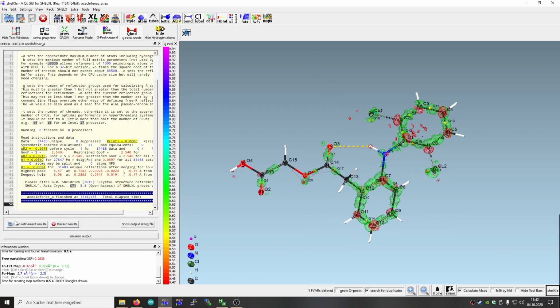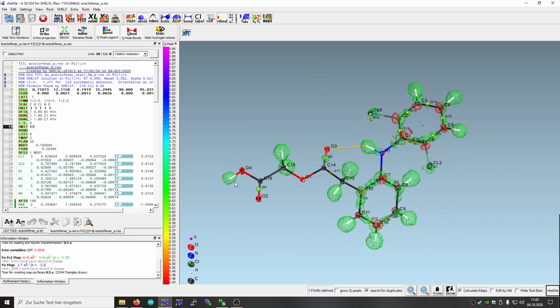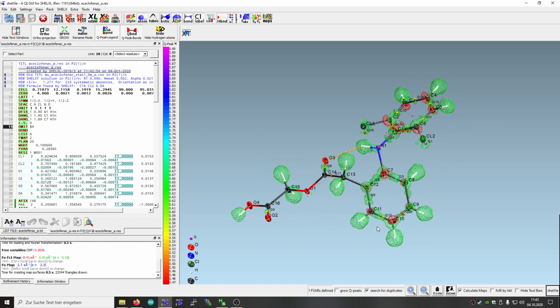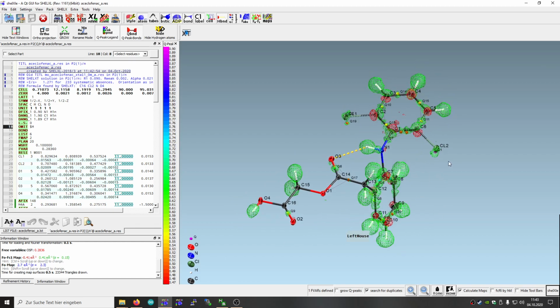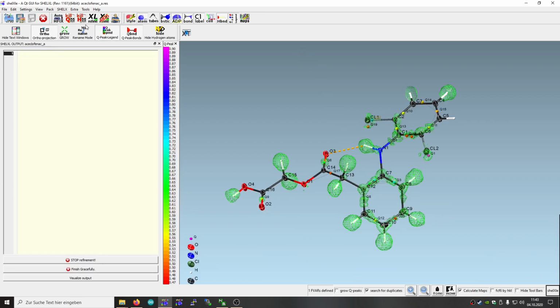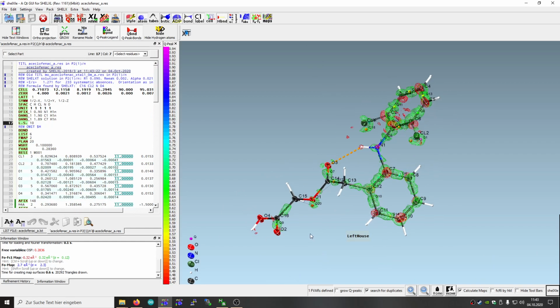And now we can see that all our hydrogens are placed nicely inside the electron density made by those hydrogens. So everything is done correctly, so we can just comment that out and change that back to 10, like this. So those density features are gone.